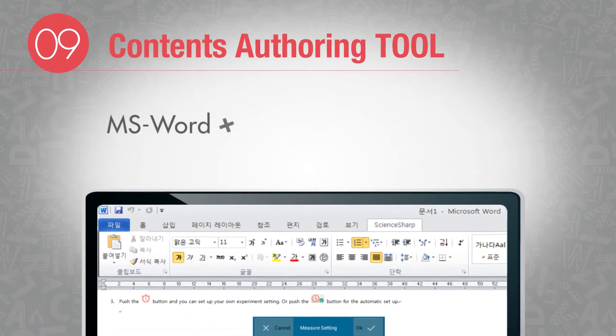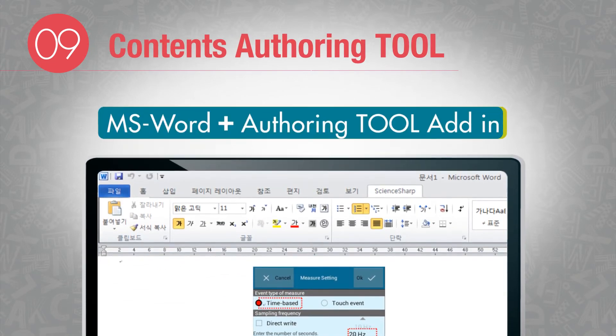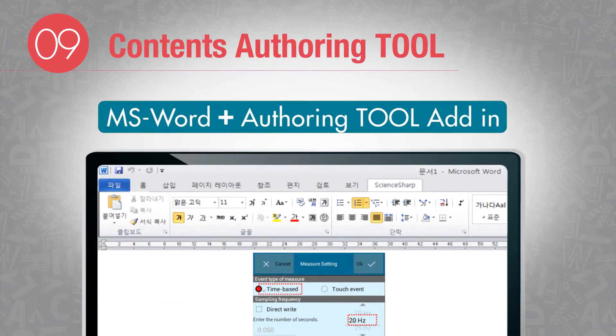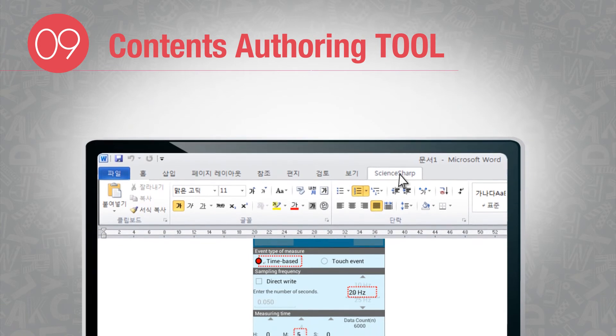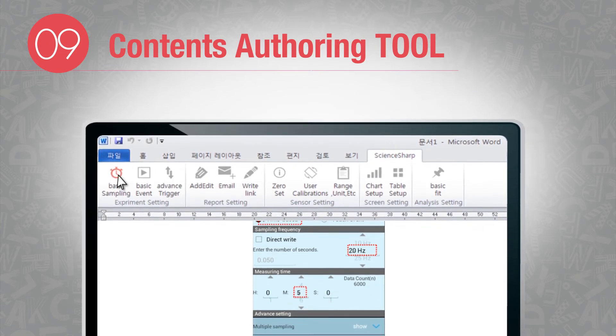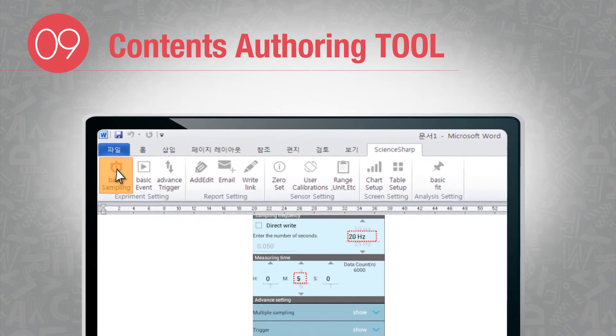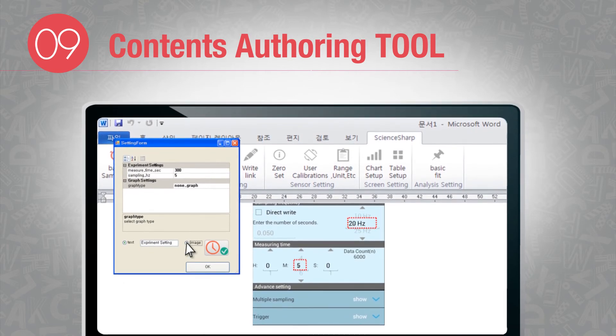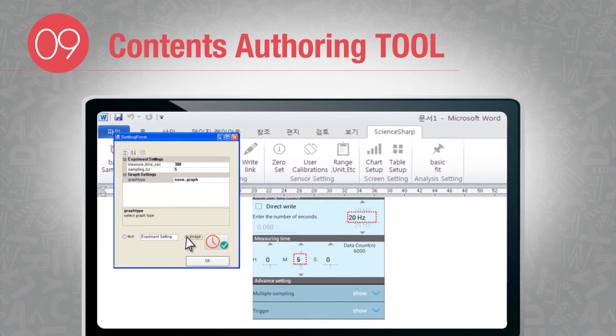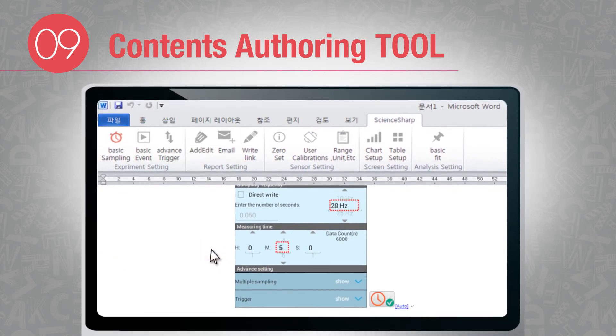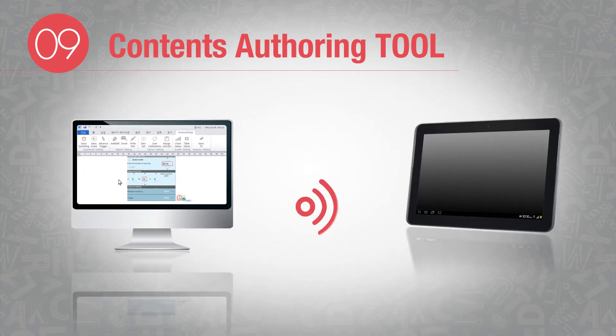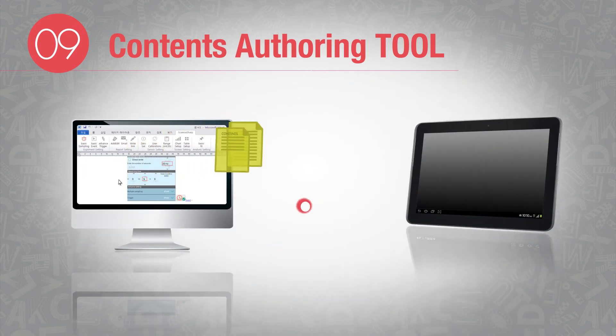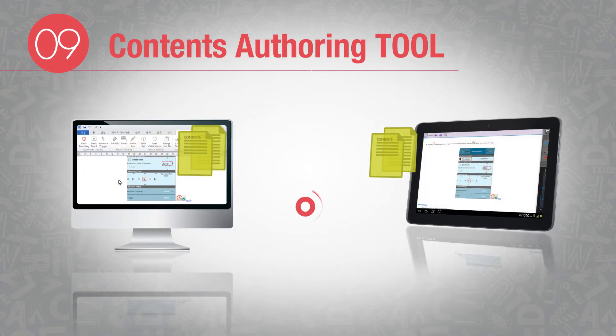Science Sharp provides a contents authoring tool. Using the add-in function of MS Word, you can create experimental contents and reports based on automatic setting for the data collection. Therefore, anyone can create their contents exclusively for Science Sharp and use it easily.